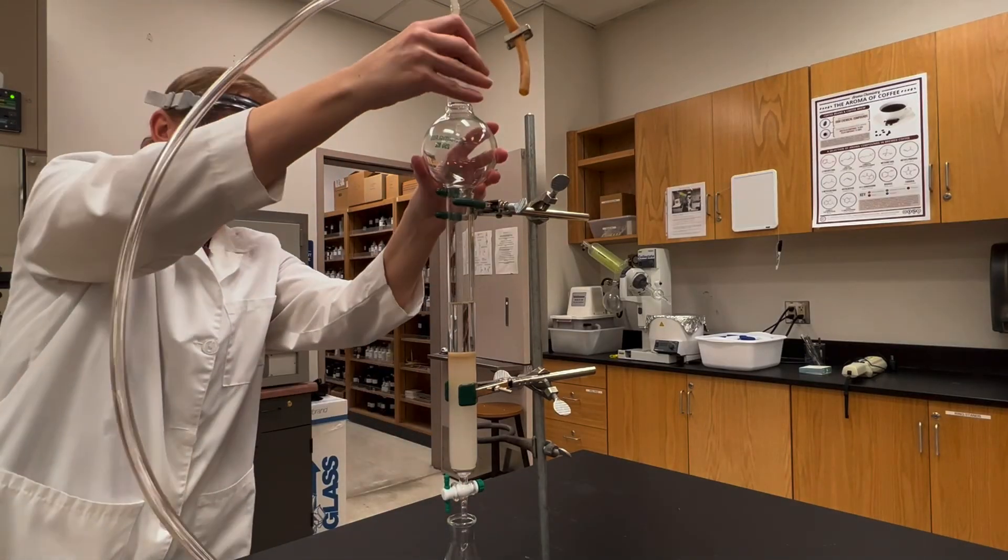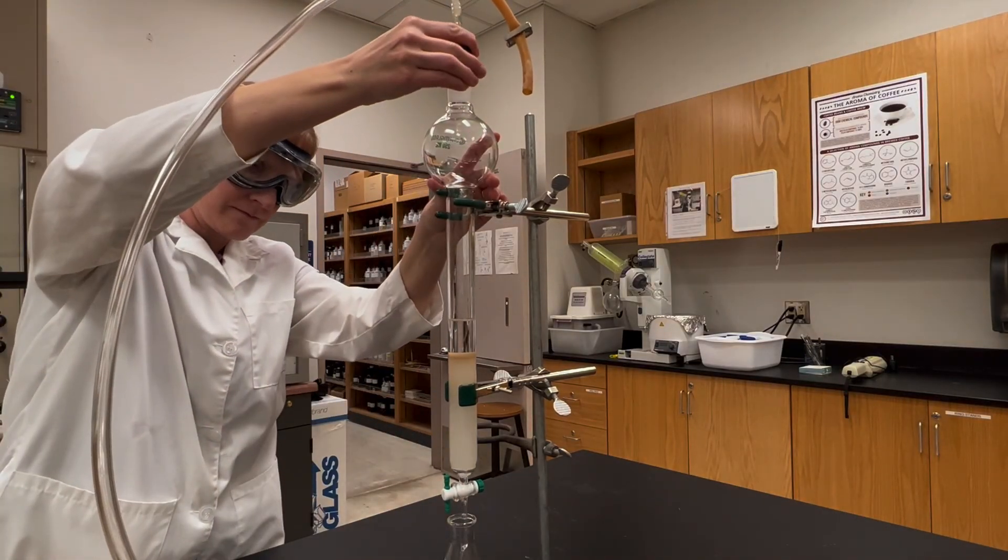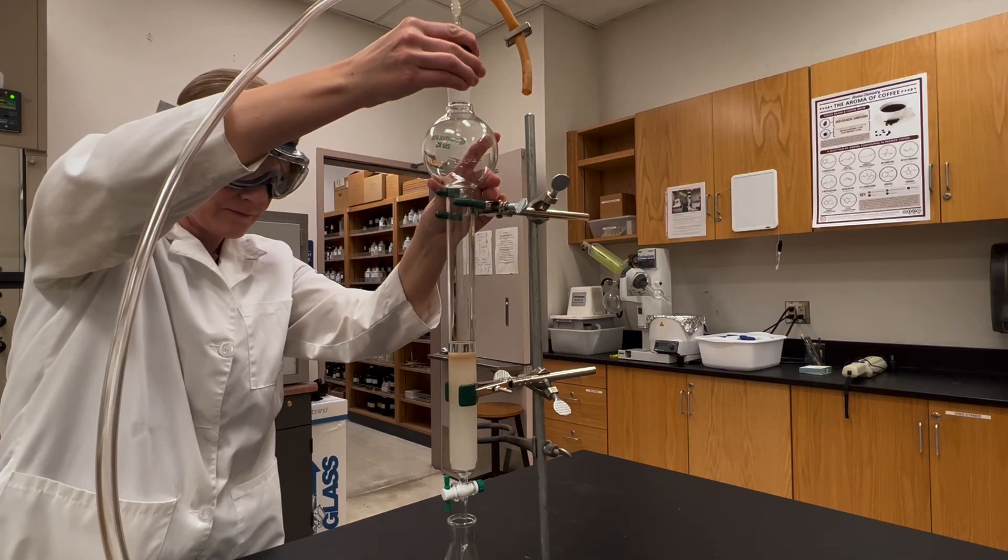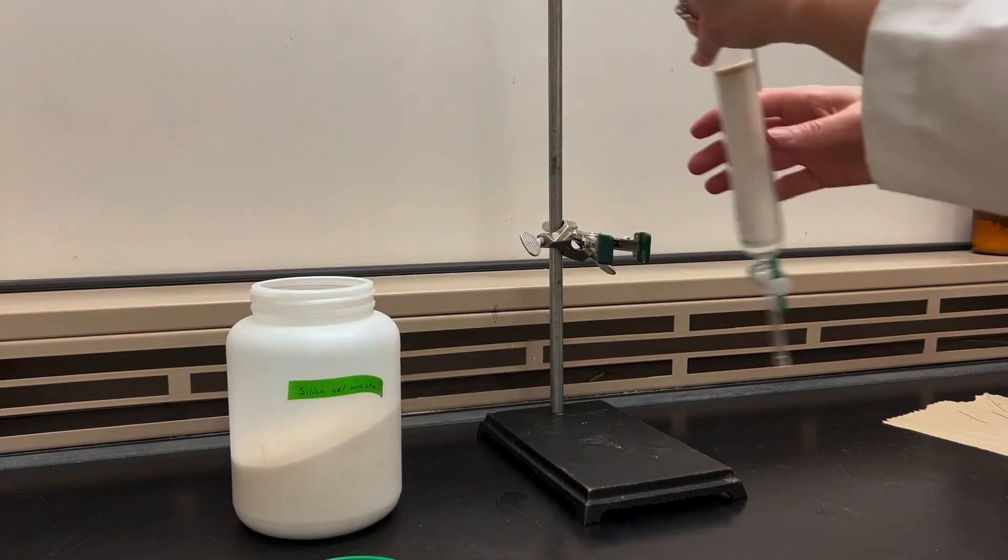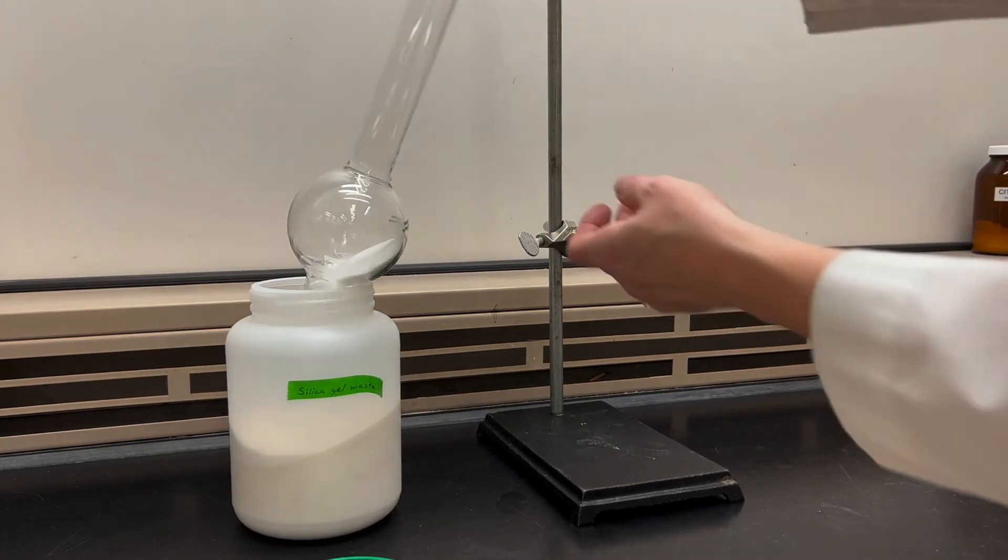To clean up, you want to use air pressure to drain the liquid from the used column and completely dry it out. Then once dry you can pour the used silica into a waste jar.